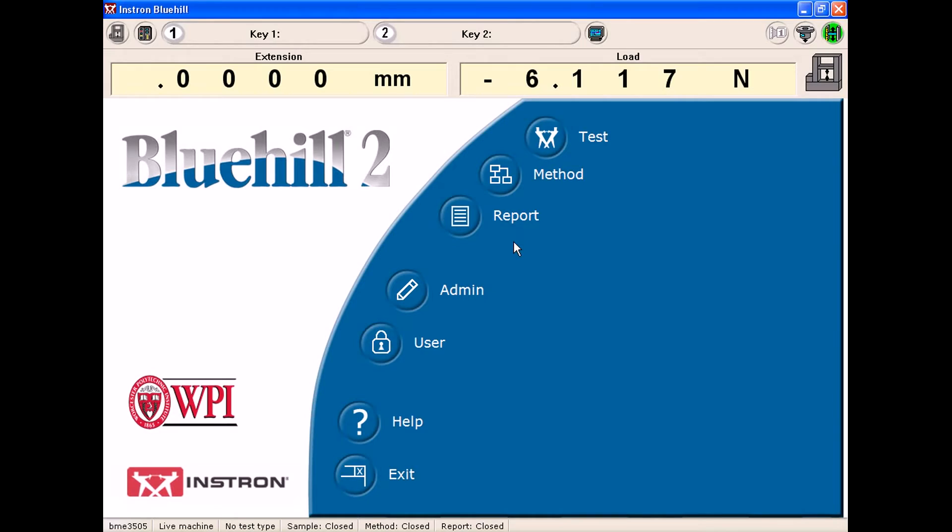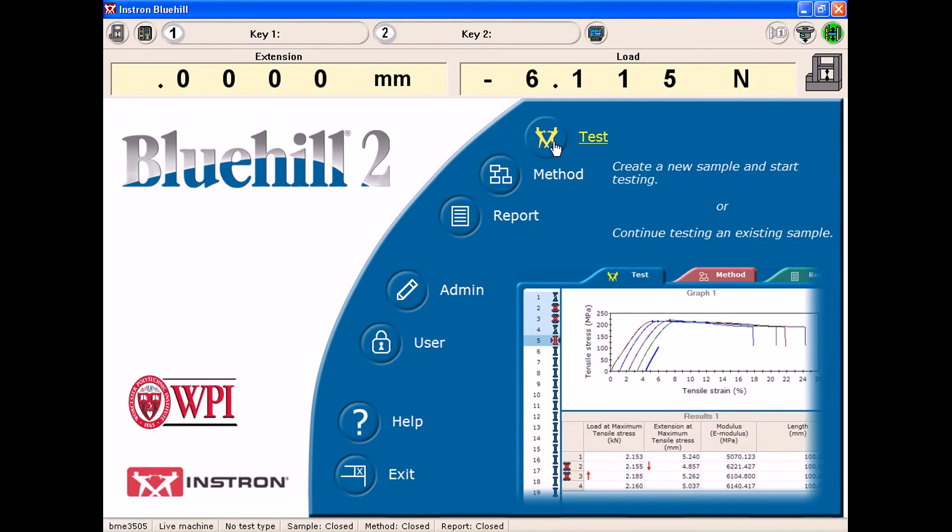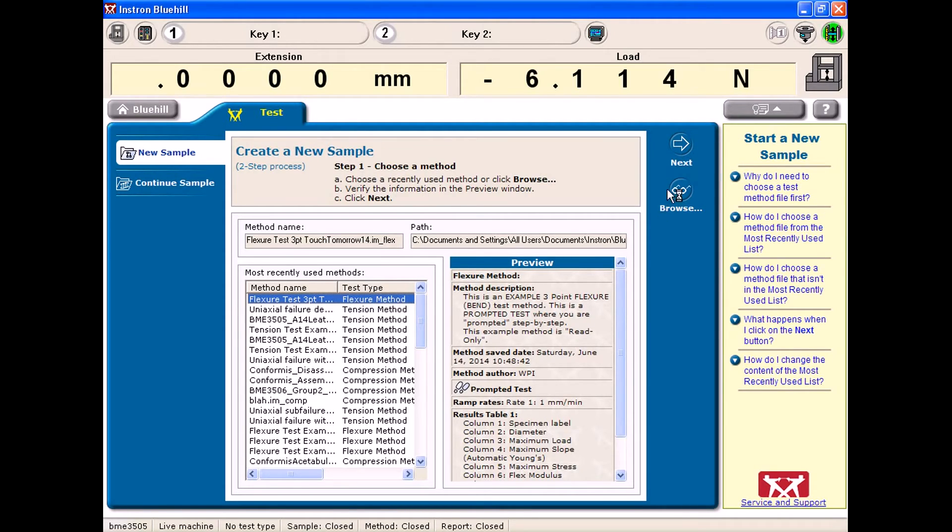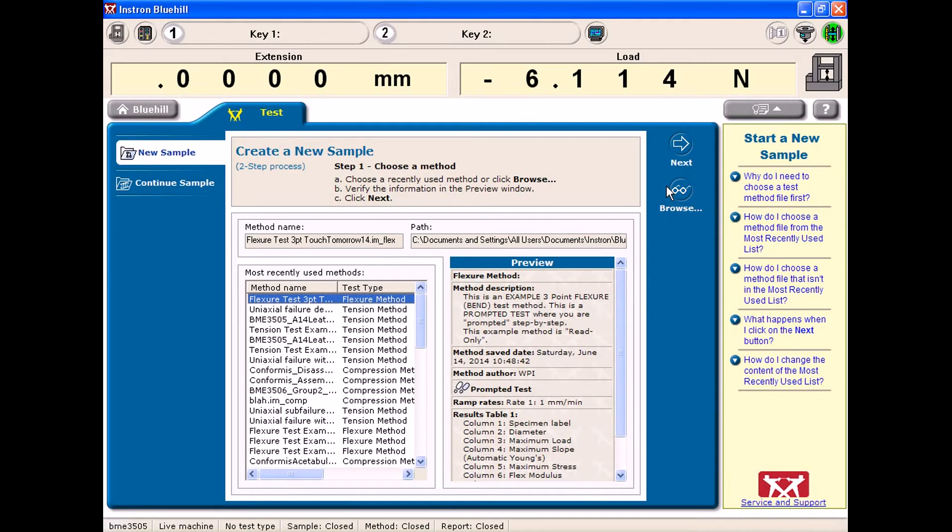Now that I am logged into my account on the software, I want to run a test and that is done by going to the test option at the top of Bluehill. This will come up with previously used, recently used methods, as well as you can browse right here for other methods that might not have been recently used.